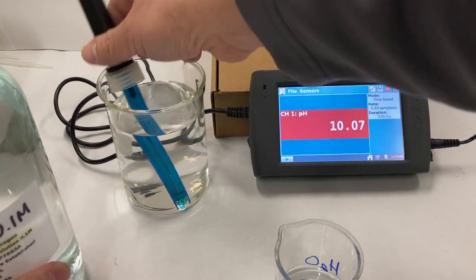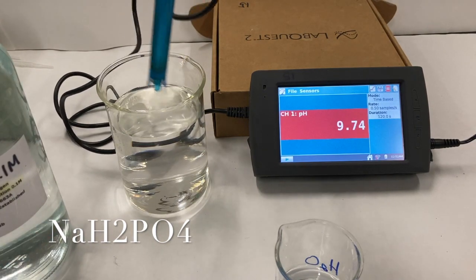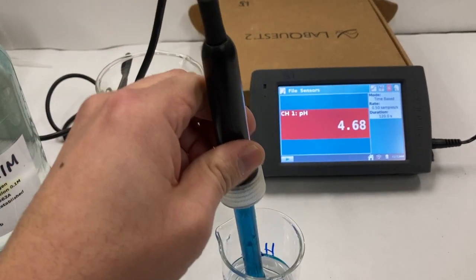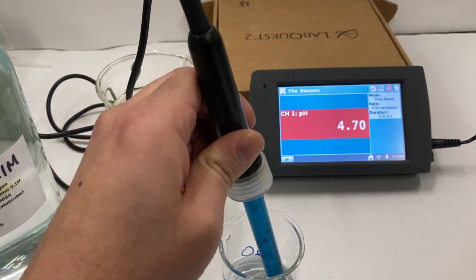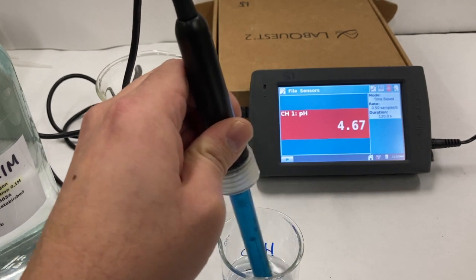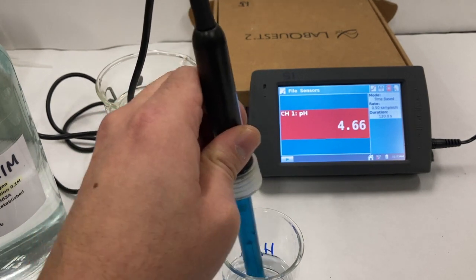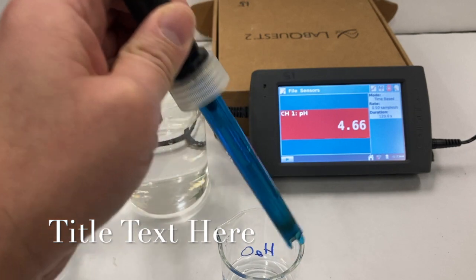Okay, so this first solution that I'm going to test here is sodium dihydrogen phosphate solution, NaH2PO4. These solutions are all 0.1 molar. The probe has a glass bulb inside of it, and so I've got to be sure not to clank it too hard against the beaker, otherwise I'll actually crack the probe and, well, then it won't work. So it seems to be holding steady right around here. I do not need to record or graph anything on the actual LabQuest. I'm just going to record the pH wherever it seems to stabilize. It seems to like 4.66, so we're going to call it 4.66.